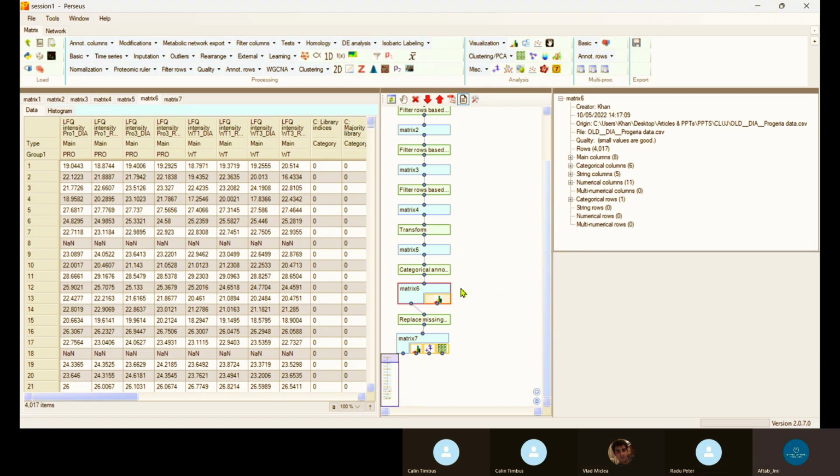So here you can't delete in between. You have to delete the lower one, in a hierarchical manner. So you have to delete the lower first, then the upper, like that.